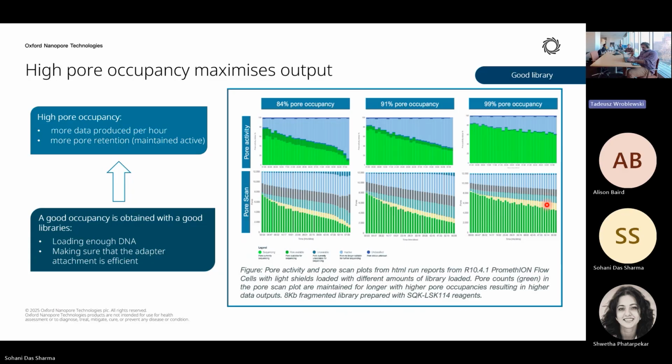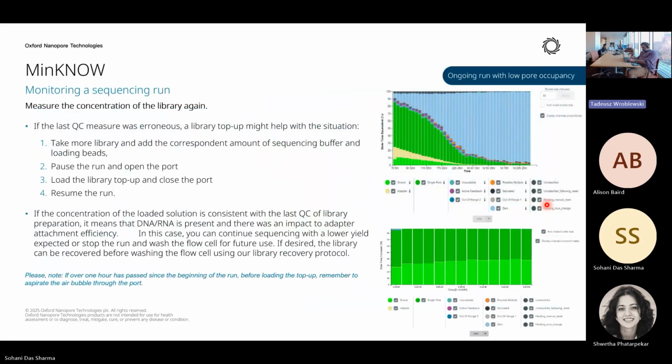That will decrease the reads we want for our sequencing, because you will just be sequencing these adapter molecules. But for our run, I think it is fine.